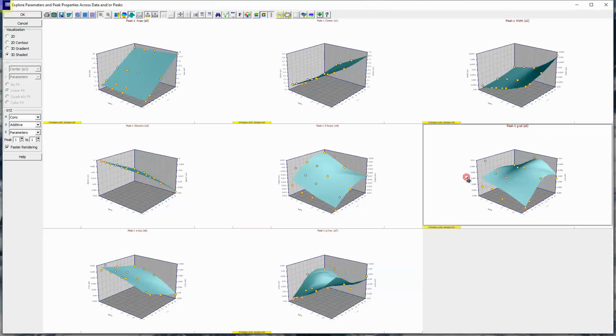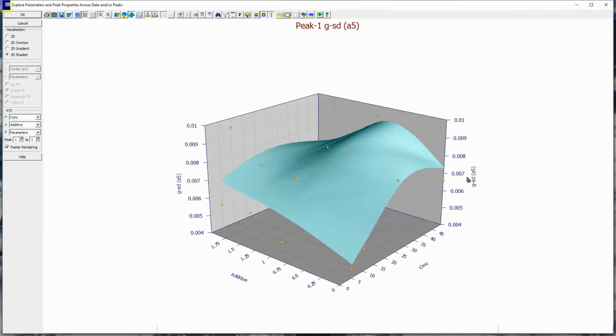If we look at A5, this is the IRF's probabilistic half Gaussian component. We believe this to some measure maps axial dispersion. If that is the case, this smooth plot suggests this parameter is indeterminate with respect to additive, but generally increasing with concentration. It's certainly a noisy plot.